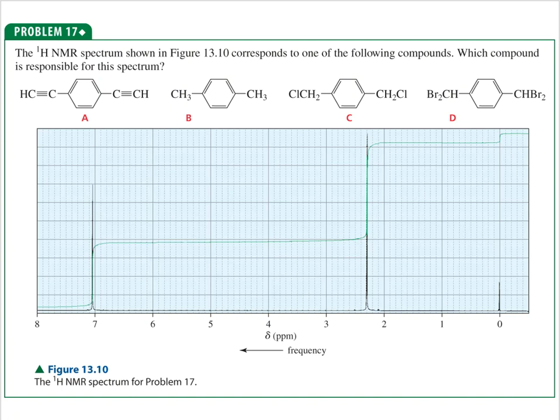In the previous video, we left off at problem 17 and we talked about this idea of matching. Which of these molecules match the NMR the best? And we talked a few things about this point, right? We've talked about identifying the number of signals. We've talked about ranking the signals in terms of frequency. We've looked at the table now, and we've talked about common areas where some of these groups show a signal. And now we've talked about integration. And integration can help us determine which NMR actually goes with which one as well.